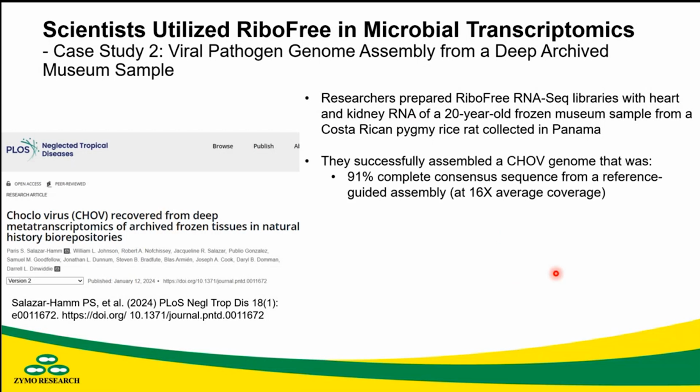With these libraries, they deeply sequenced it and successfully assembled a hantavirus genome. The reason they are interested in this hantavirus is that hantaviruses can cause severe diseases in humans, but they can also be maintained in rodent populations without harm. So they believe that this piece of sample could provide very valuable insights.